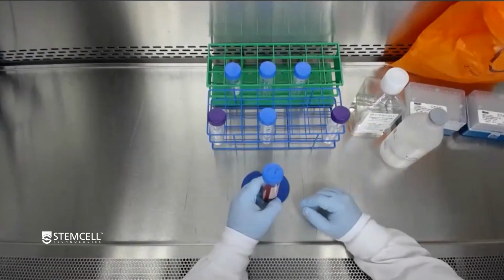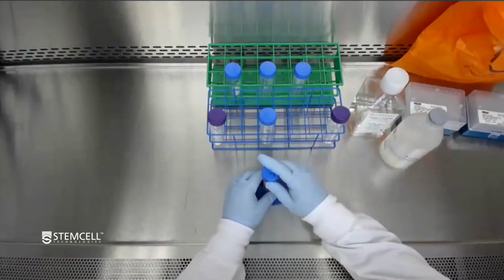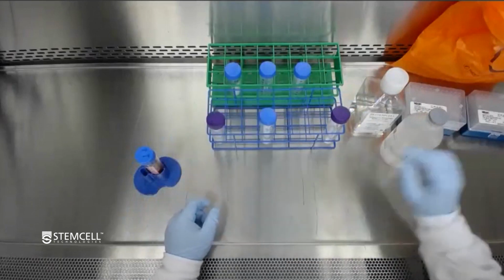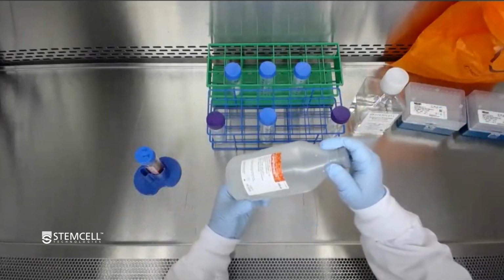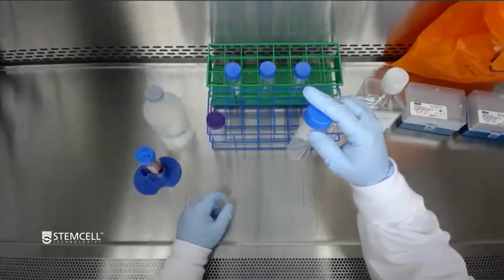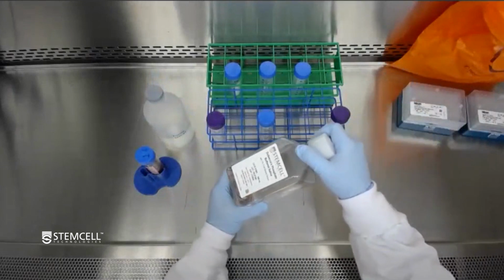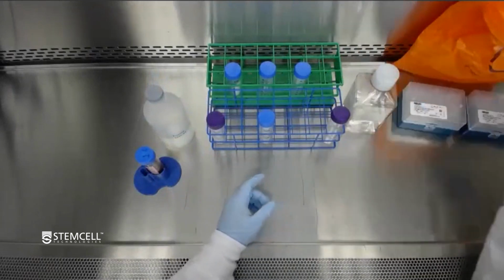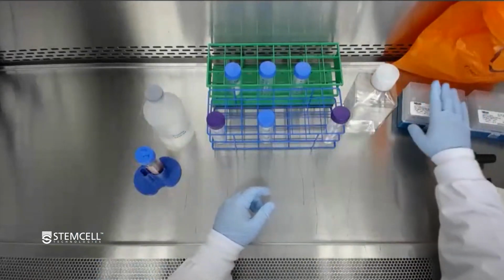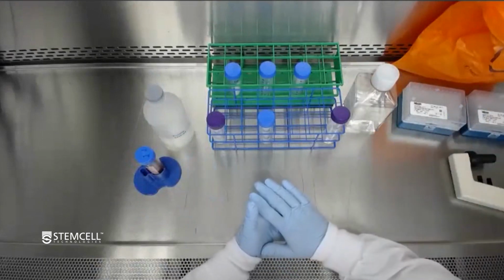To perform a SepMate density spin, what you will need is, of course, peripheral whole blood, a SepMate tube, density media such as Lymphoprep or Ficoll, an empty tube in which to dispense your blood and then dilute it with PBS and 2% FBS. You will also need serological pipettes, pipette aids, as well as tips for counting, and also some liquid waste as well as a waste bag.